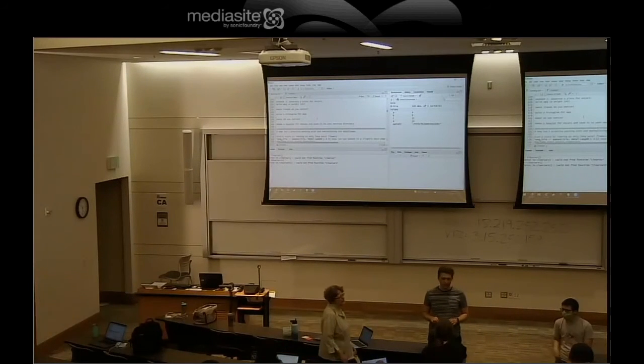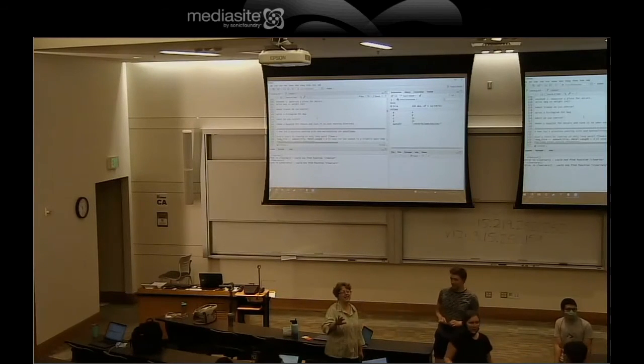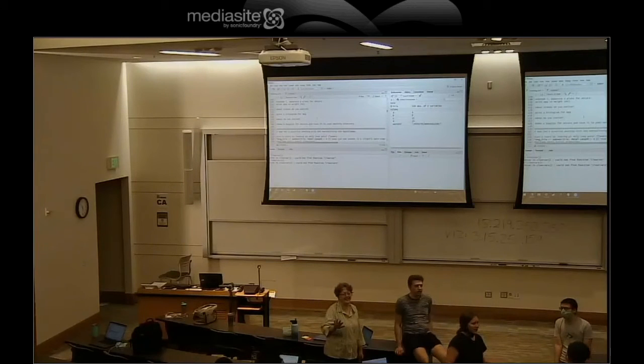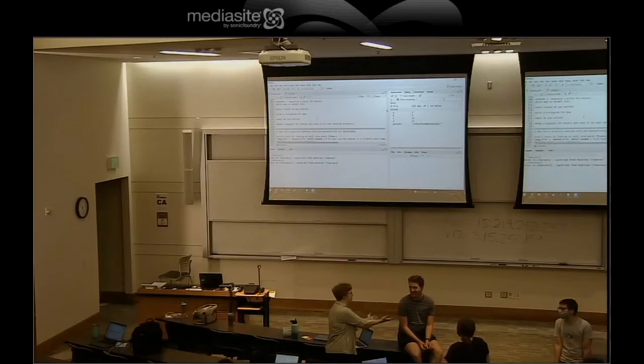If you're going on to section 4, the whole start of section 4 is explaining what a package is and how to install it. So if you try to filter without first installing tidyverse, it won't work. You should be reading the comments, not skipping them because they're green. The green will not count as code, but it explains what you're doing. That's a lot of people. The point of section 4 is what's a package, how to install a package, and then run it.